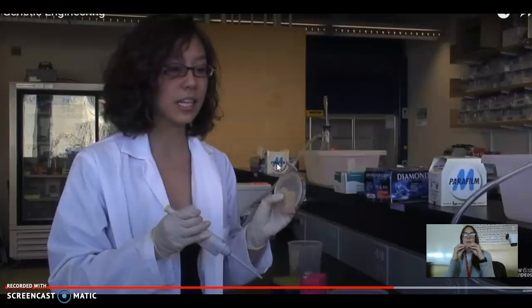So I make it to where the bacteria can grow on this broth, all awesome, all good. But I also add in ampicillin. So ampicillin is an antibiotic. So break that word down, antibiotic. It's anti-bacteria. So antibiotics kill bacteria, and that's why you take antibiotics when you get sick with a bacterial infection. But why would I do that? Why would I kill off the bacteria?